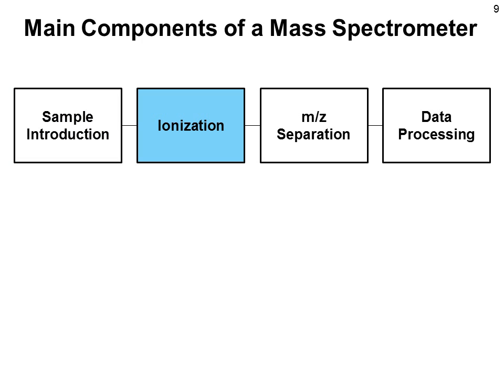There are a number of possibilities to ionize molecules for mass spectrometry. Electrospray ionization is very important for molecules in the liquid phase, such as after liquid chromatography. It's also very important for biological macromolecules such as proteins, since it is a soft ionization technique and it will not, or to a little extent, break the molecules during ionization. We will hear more details about this ionization technique in a minute.